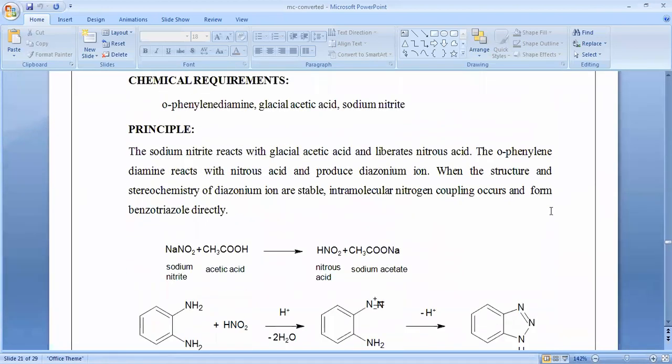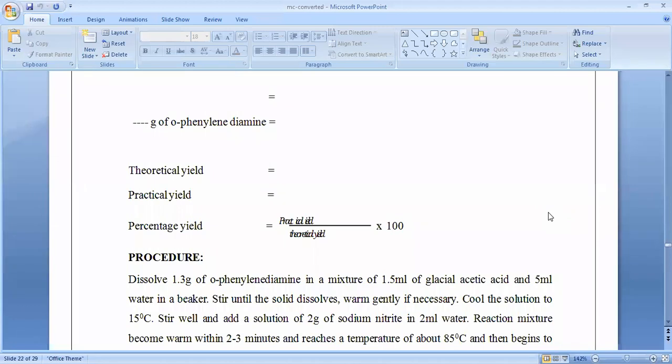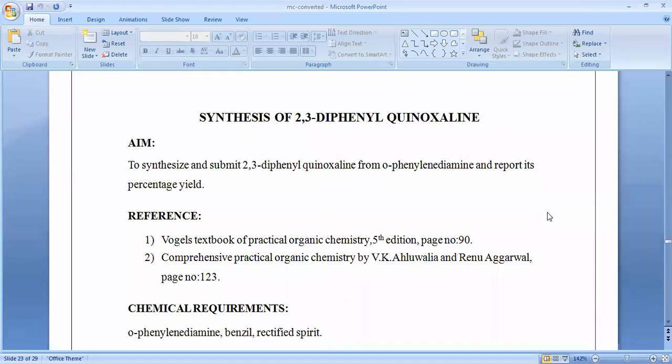Today we have discussed the synthesis of the phenytoin drug molecule, which is used as an antiepileptic agent. And next, just now we have seen the anesthetic agent, that is benzocaine.